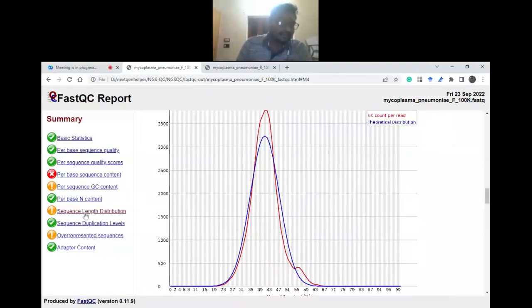Sir, I have one question. If a gene of interest is of high GC content, and Phred score is related to GC content, all right? No, not related. If the GC content is high, then Illumina sometimes has higher error rates, but it is not related.